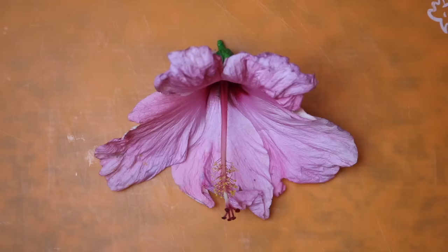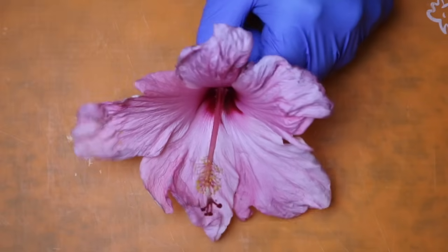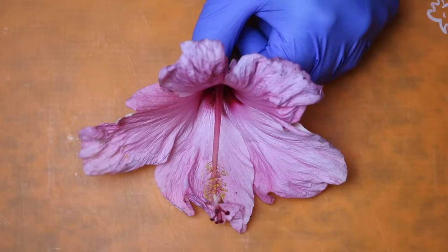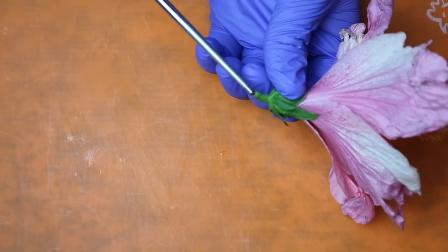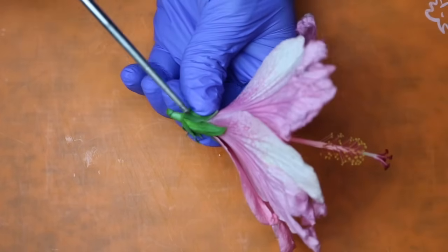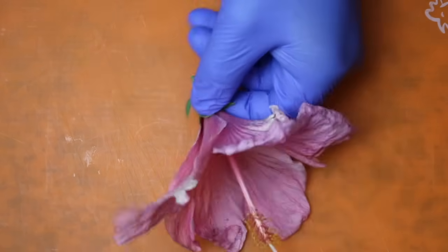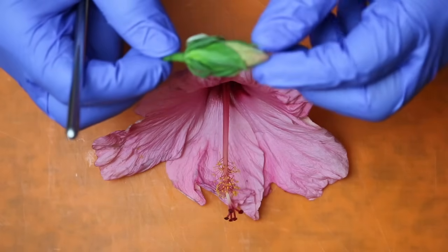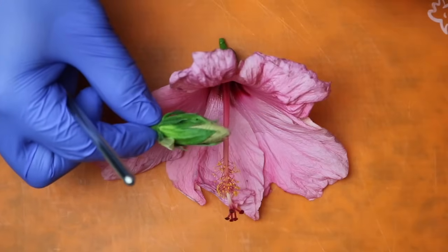Before we go cutting into our flower, we're going to familiarize ourselves with the parts of the flower. These five pink parts here are the petals of the flower. If we turn it over and look at the bottom here, we can see where it would have been attached to the stem, as well as these green little leaves — those are called sepals. If we look at the outside of the bud of the flower, we can see that is what protects those petals inside.